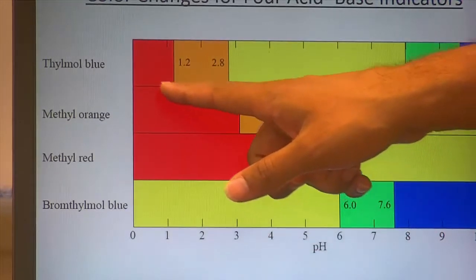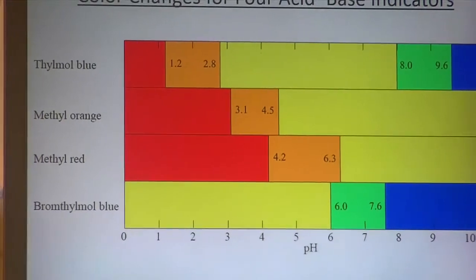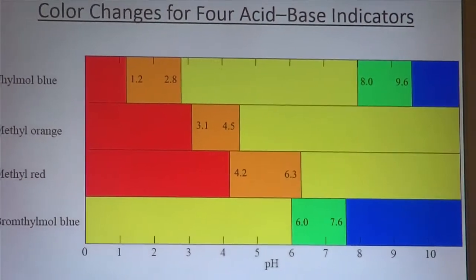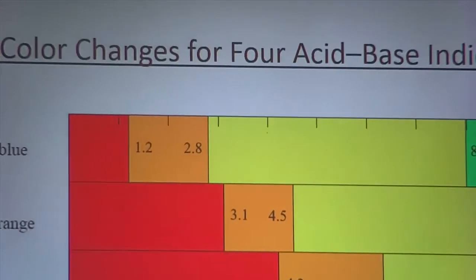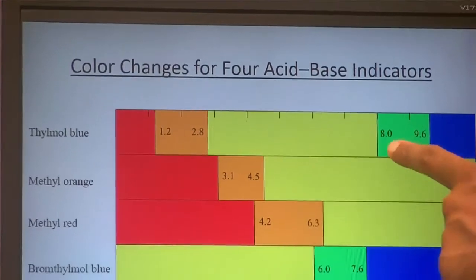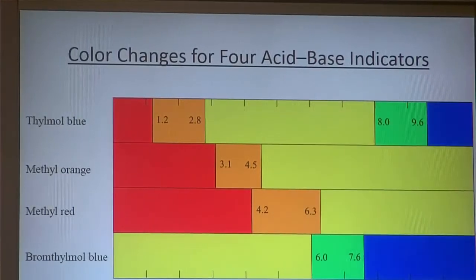Well, look at the pH range where each of the indicators is functional. So the most responsive indicator will be given by the most apparent color change. So you'll want to use thymol blue for a substance where the pH is from 1.2 to 2.8, so you would expect that indicator to be orange. If the pH of the acid that you're testing is between 2.8 and 8, then you want to go with the indicator thymol blue. It's going to be yellow in that range, but I would argue that's not a good choice. Why would I argue that it's not a good choice?